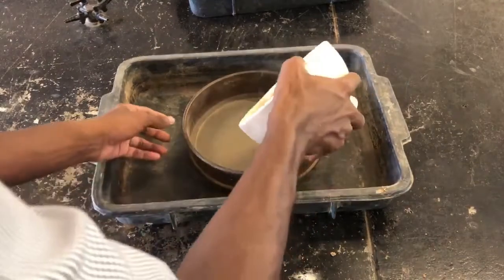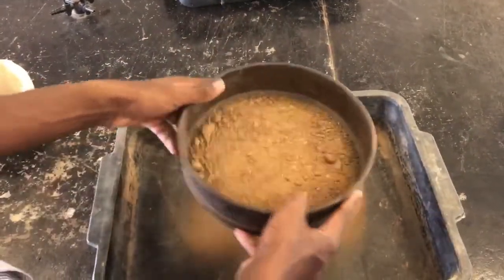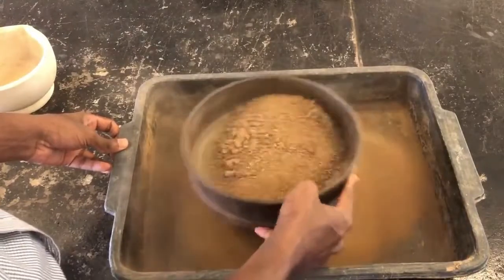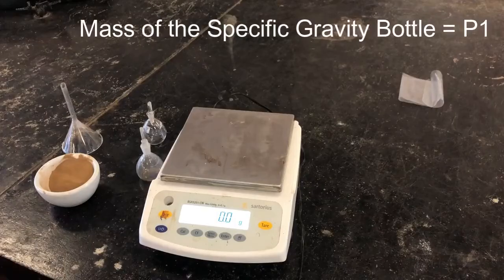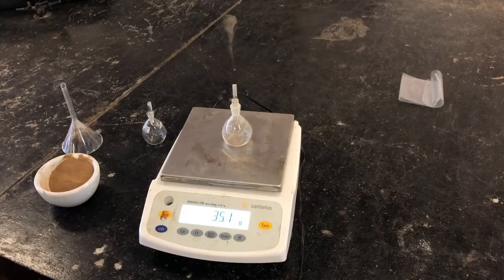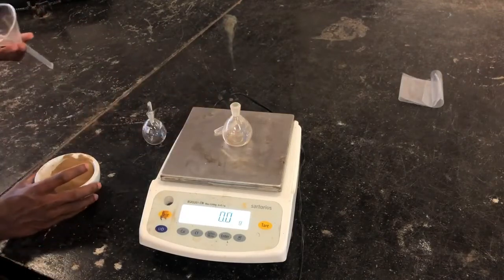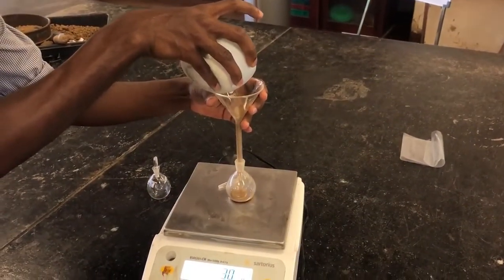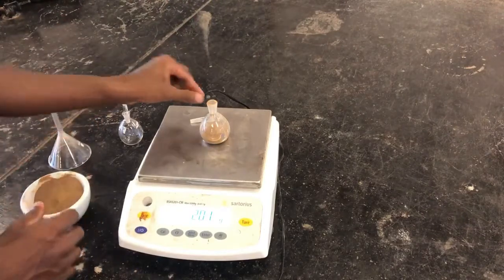Now we have to sieve the well ground soil sample using the sieve. First, take the weight of the empty specific gravity bottle. Then add about 20 grams of sieved oven dried soil into the specific gravity bottle. Now we have taken 20 grams of soil sample.